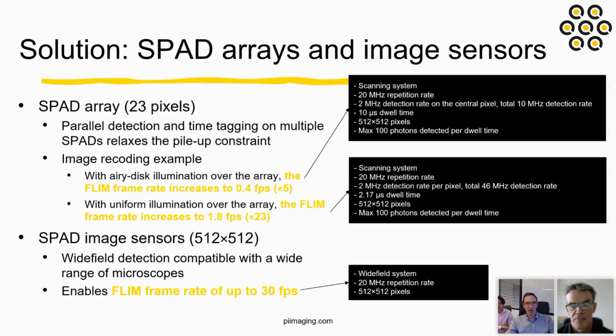If you talk about 1 pixel, this is correct. Here we are talking about SPAD arrays, so this is incorrect. If you distribute light over multiple pixels, then we can differentiate between 0 all the way to the number of pixels, representing the maximum number of photons that we can capture at the same time.